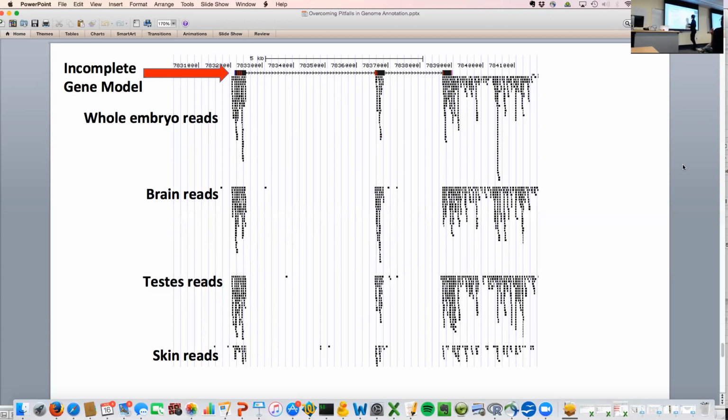And then if you don't curate your model, all the reads that are left over from these non-coding exons, you're not going to count. So this is, again, why it's really critical to do this manual annotation. I think you were alluding to this the other night with me when I was asking you some questions about if your goal is to use RNA-seq data for gene expression quantification. Is this what you're talking about? This is what I'm talking about, yeah.